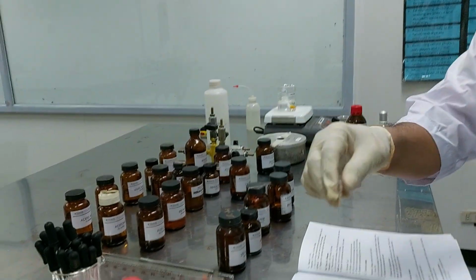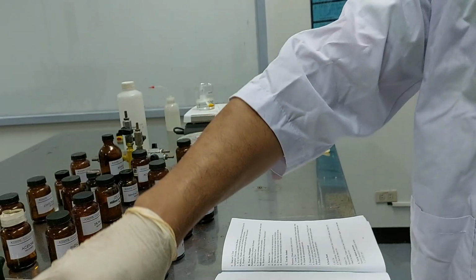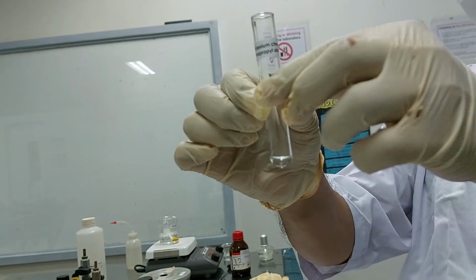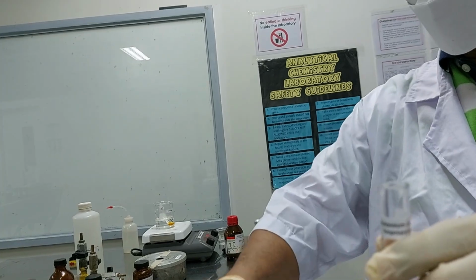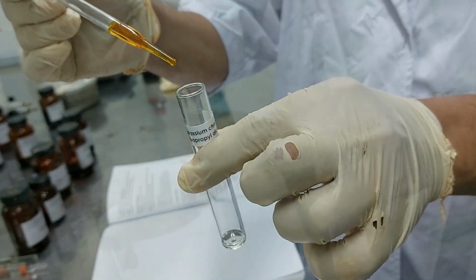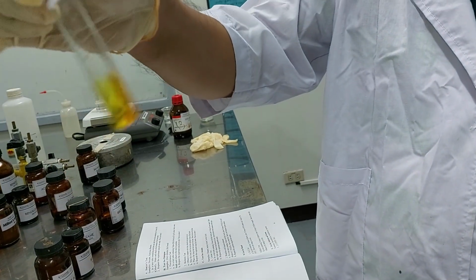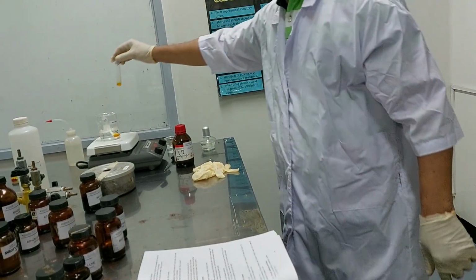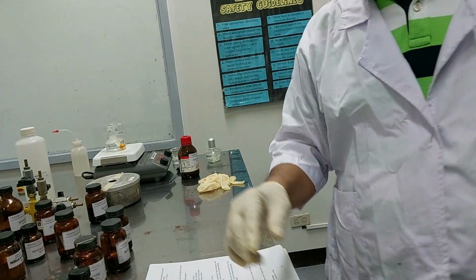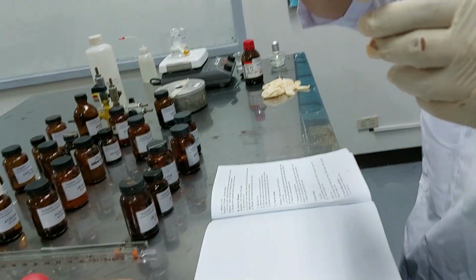So that is tertiary. Now let's go to secondary, which is our isopropyl alcohol. We have 10 drops already of isopropyl, so we just have to add 10 drops of potassium dichromate. Shake and then place in the water bath, heated at about 70 to 80 degrees, not boiled.